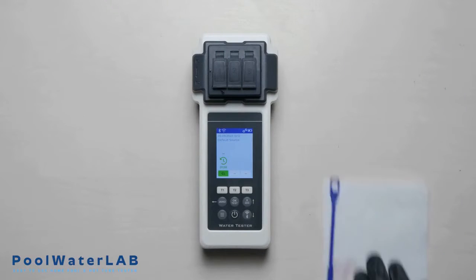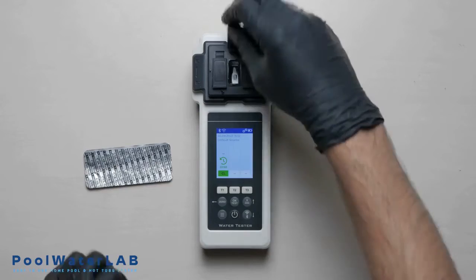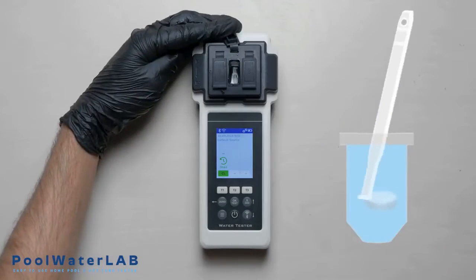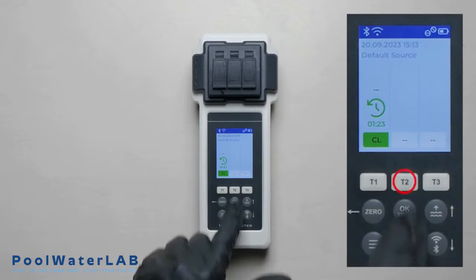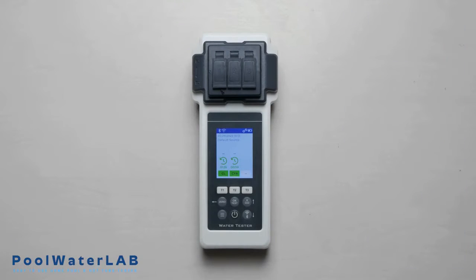Add the tablet of CYA test into chamber number 2. Using the special stirring stick, crush and stir the tablet until it is completely dissolved. Cover the measuring chamber and press the T2 button.